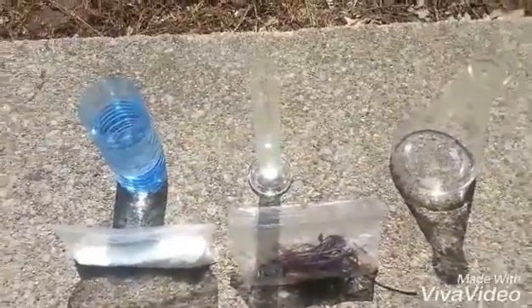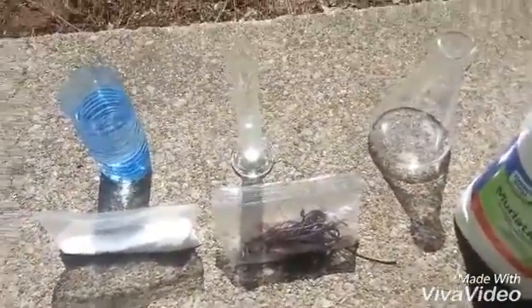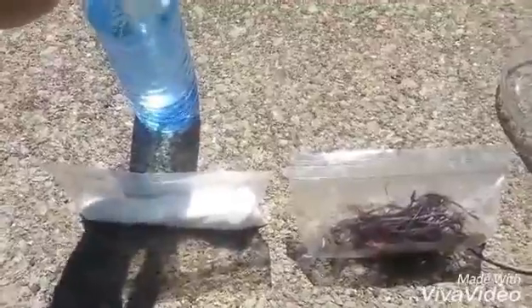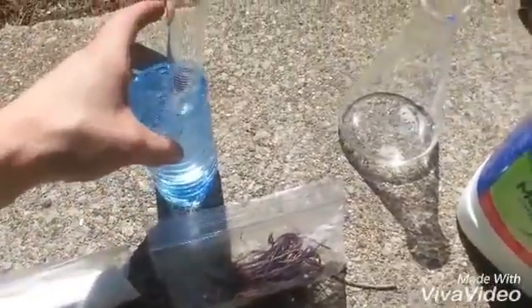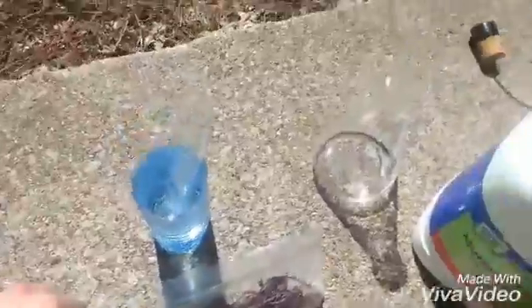To dissolve my gold nugget, I'm going to prepare 25 milliliters of nitric acid. And to do that, I have 25 milliliters of hydrogen peroxide that I will be putting into ice cold water, to help the nitrogen dioxide dissolve when I make that gas. And it's better to put ice in here, but I don't have any ice.